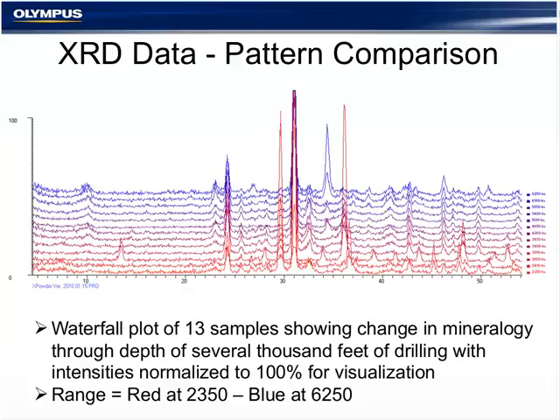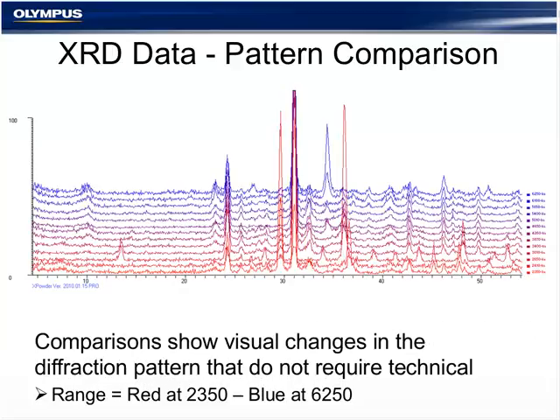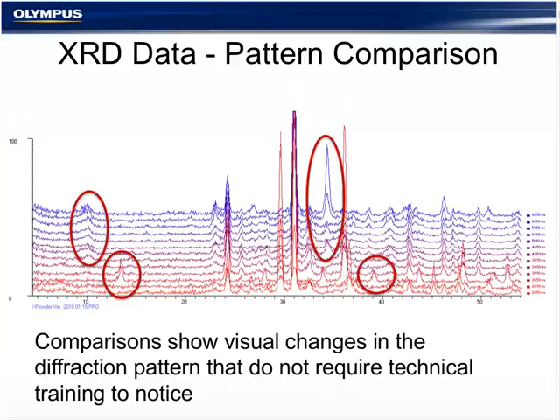The waterfall plot allows you to easily visualize the changes in mineralogy by the appearance or disappearance of peaks over the drilling depths, as the example shown here, circled in the waterfall plot.